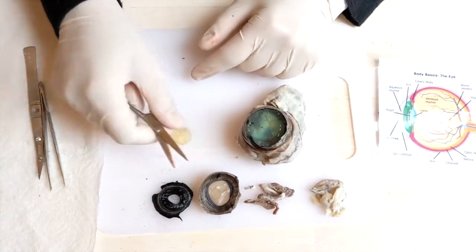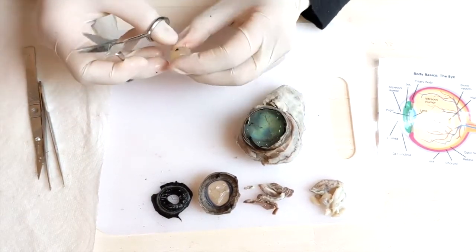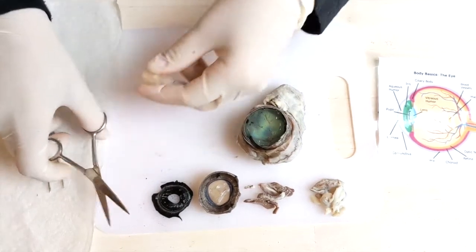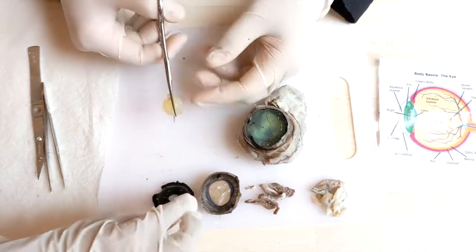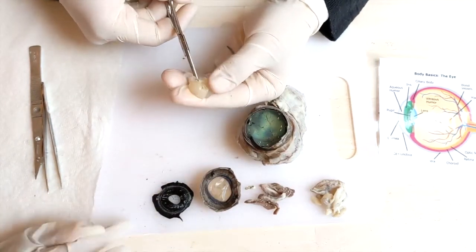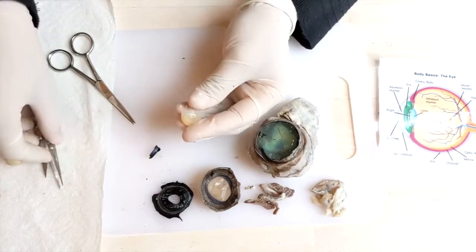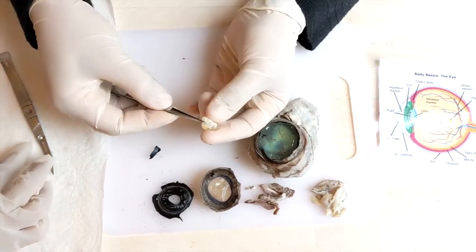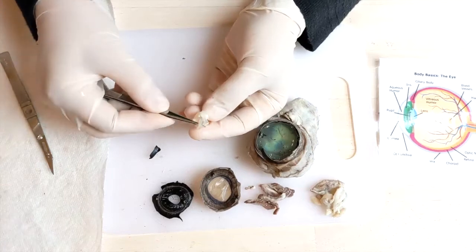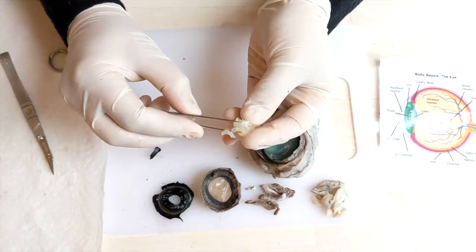Alright, so let's try to cut through the lens. I want to show you guys that the lens is actually made of... Oops, we got some of the iris right here. I forgot that. So let's cut through the lens and show you the different layers the lens has. It's very cool. Look at that. Whoa. The lens is made up of layers, just like onions. Look at the layers of the lens.